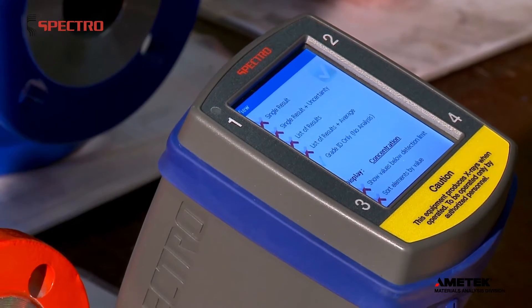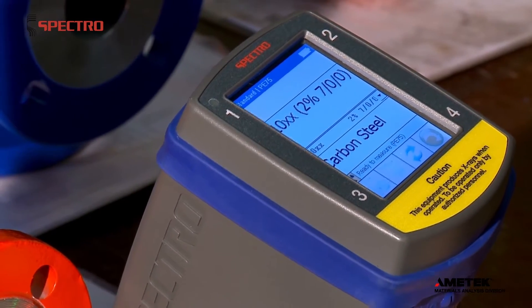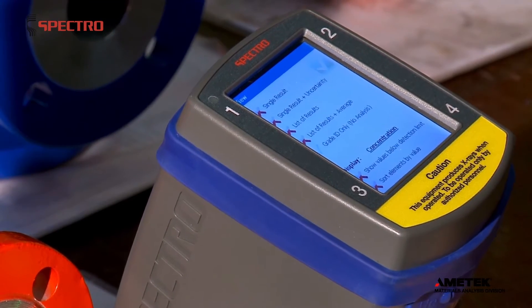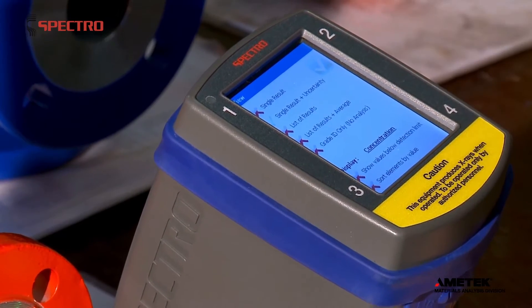If you're only interested in the grade, switch over to the Grade ID view. Interested in the reliability of the measurement result? Just select another view for additional information, then go on to analyze the next sample.